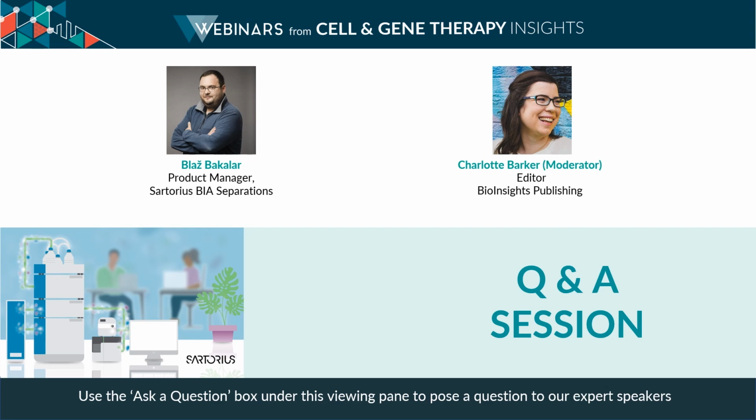Thank you. And another question here: what concentration of linearized pDNA would you need to be able to achieve mRNA concentrations of 12 milligram per milliliter, as you showed on slide 18? Oh, I don't know that one off the top of my head. No problem. Well, viewer, we will try and get back to you by email on that one. So if we look at it with the transcription factor at 400 and reaching 12 mg/ml, you would be able to achieve 1 to 100 easily.